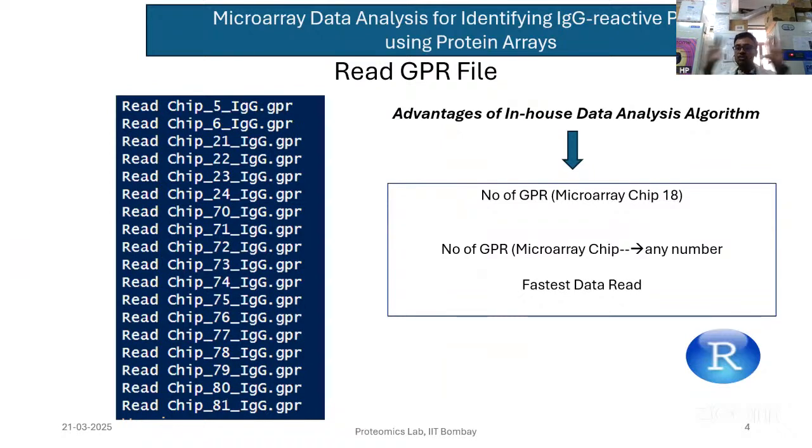If we consider two data frames in R, let's say for spot 1 and spot 2, just this plus this divided by 2. How can you proceed? With a loop algorithm, using a for loop or while loop in R. This way you can find out the average for a number of features at a single time, because this is the advantage of coding. Otherwise, you need to take every block and go ahead with spreadsheet work, which will take a lot of time because it is big data.